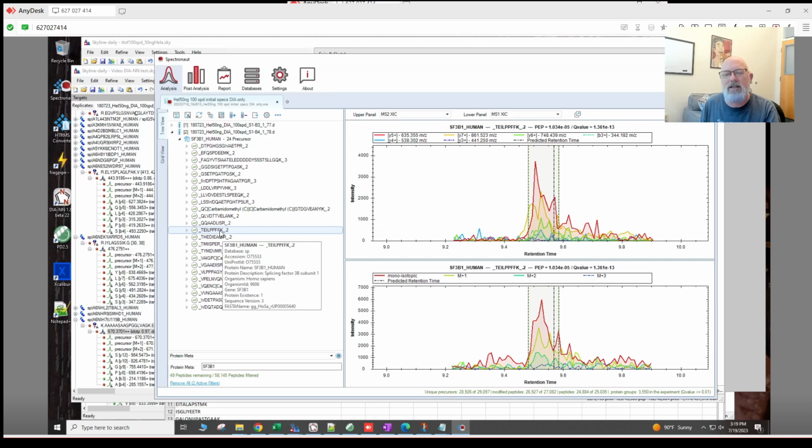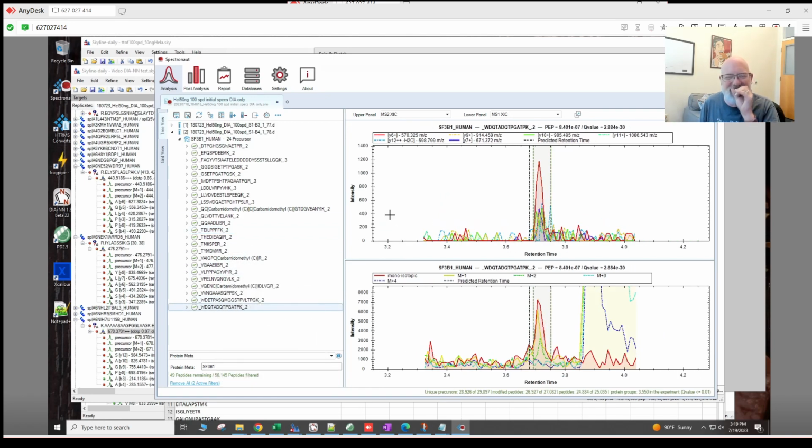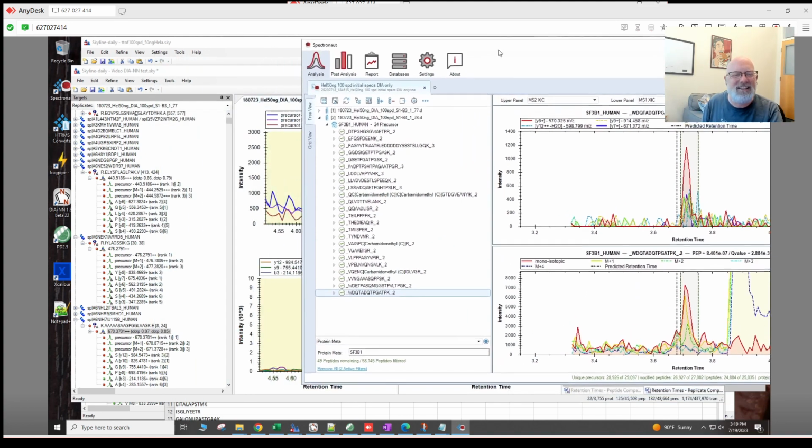See, oh yeah, some of these you're like, wait a minute, what is it picking? All right, let's look for that one. That doesn't look so bad.